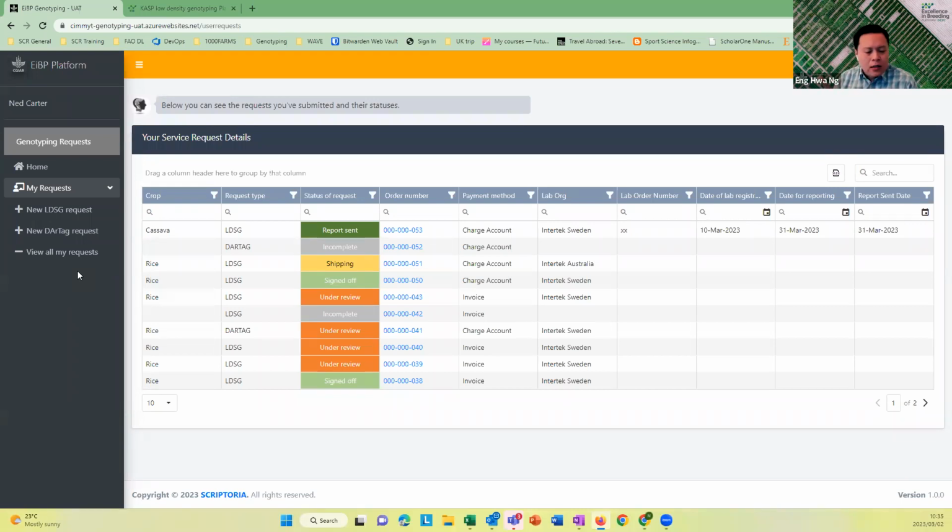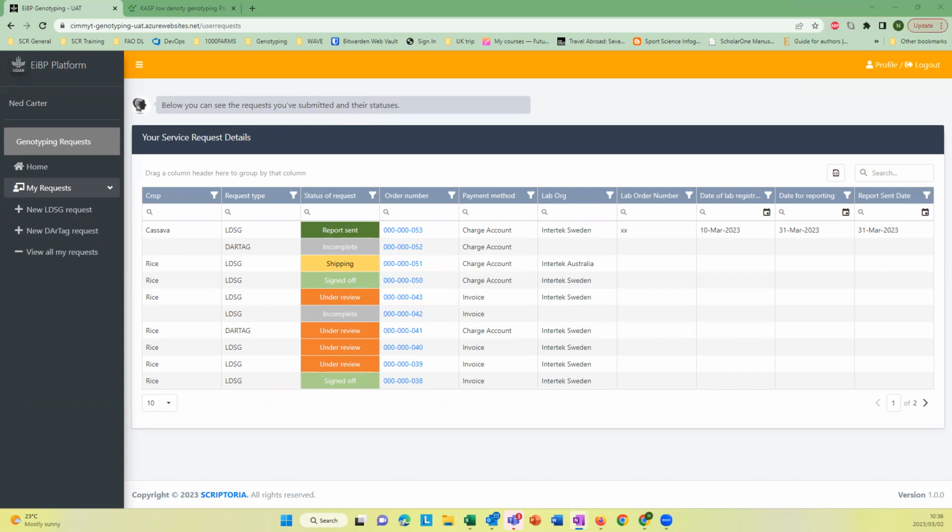I'm envisioning that based on the lab you selected, you can also download those exemptions. So it's sort of like one place, so that you can't really be wrong in printing the wrong forms and then it's not the right one going to the lab. So that's something that we're looking into for the next iteration. Cool, thank you.